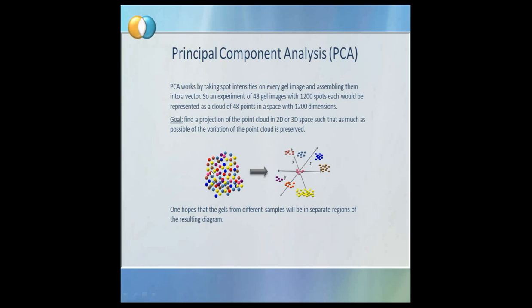So if it's true as here, we have a number of data points, and if they are well separated like here, so the colors stand for replicates, then we have done a good job, since all these nice clusters show that the similarity within the cluster is higher than across the clusters. Or in other words, the variation between clusters is higher than within clusters.